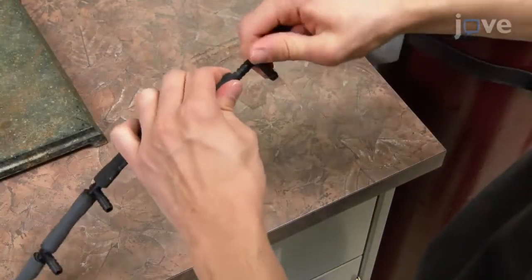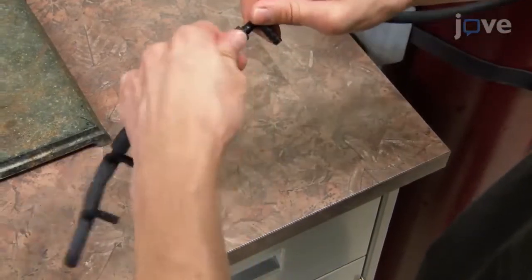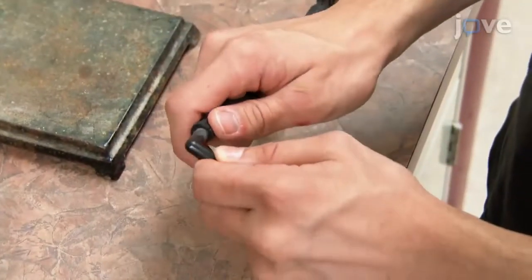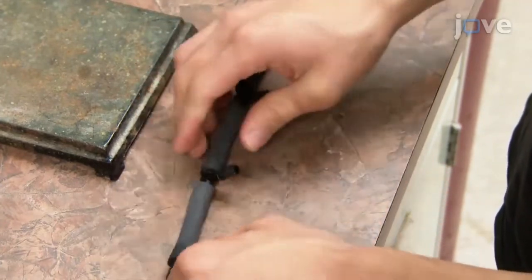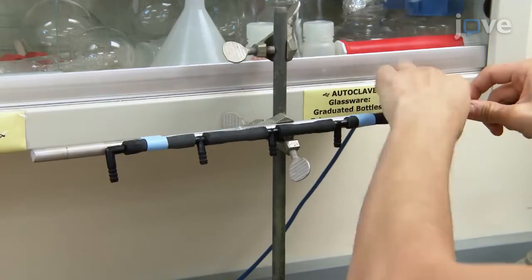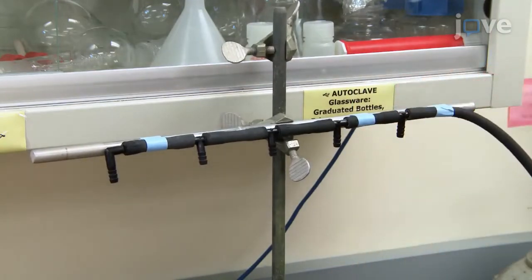Connect one end of this line to the piece of tubing at the output of the nitrogen tank through an extra T-shaped fitting. Add a 90-degree elbow fitting at the other end. Use tape to attach the structure to a horizontal metal rod placed approximately 30 centimeters above the bench.